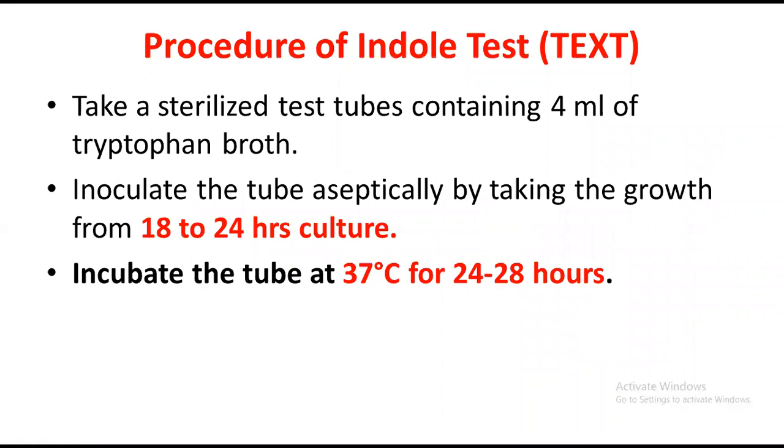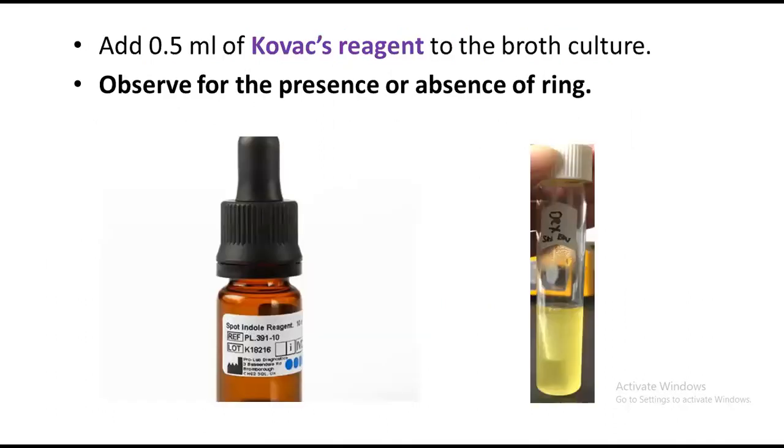This is the procedure of the indole test in text form. Okay, as I have told you in the previous slide, in the animated form, this is all about these three steps, how you should perform an indole procedure. So you can use these slides in your assignments and your presentations. After that, now here comes the main step.